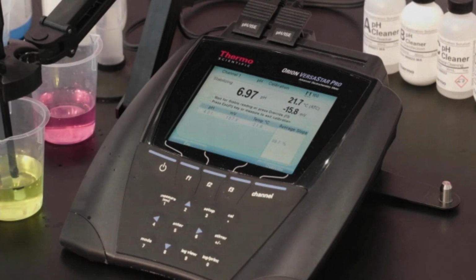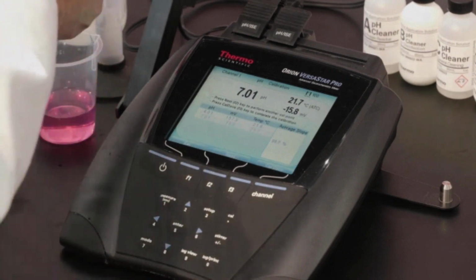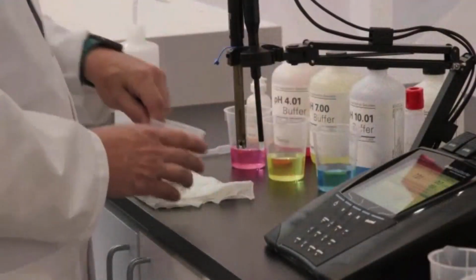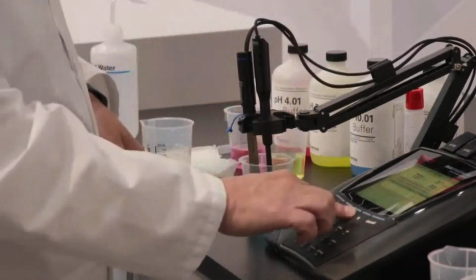So just like the first one, the meter will take a reading, will auto-recognize the pH 7 buffer, read the temperature, and assign the correct value for that buffer at that temperature. And this will give us our most accurate calibration. Here we go. And he's accepted that. And we'll repeat the process. Rinse the electrode and the stirrer, everything that goes into the beaker. This will be our pH 10 buffer.